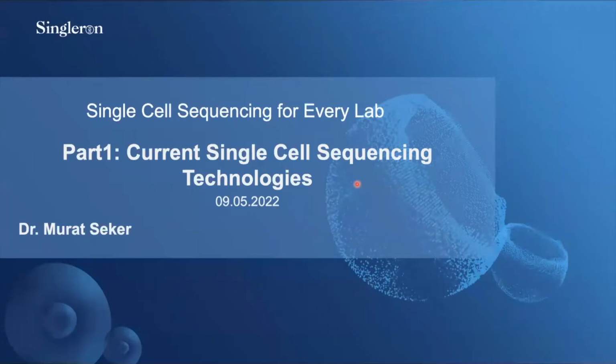This webinar mini-series includes 3 sessions. In today's webinar, part 1, we focus on current single-cell sequencing technologies. In this webinar, our expert will help you understand single-cell sequencing workflow, comparison of current technologies for single-cell sequencing, advantages of portable devices for single-cell sequencing.